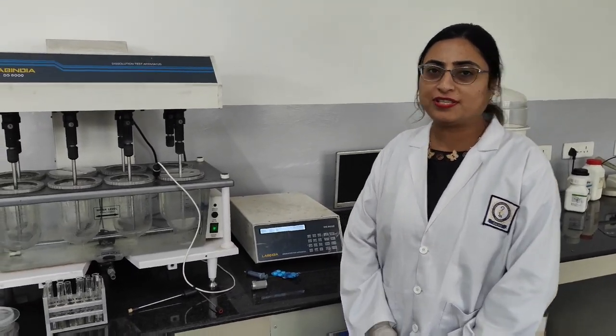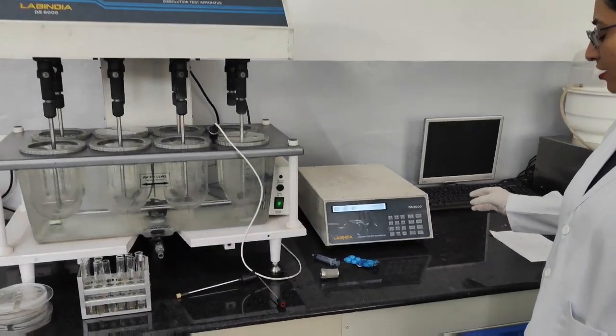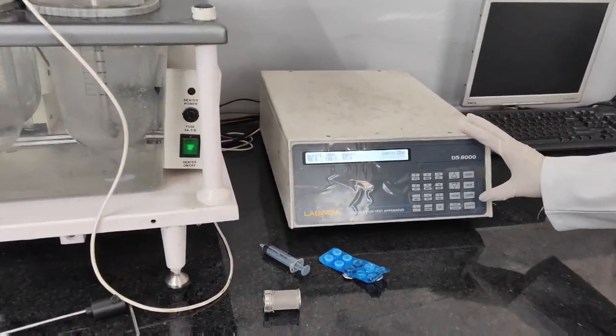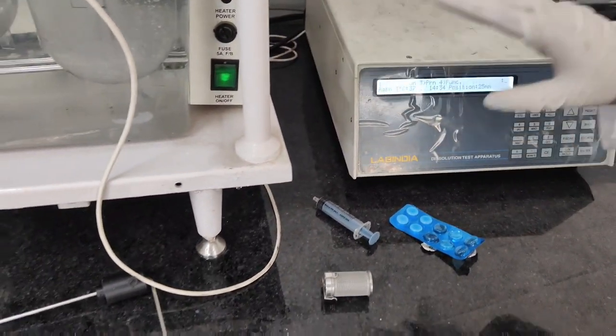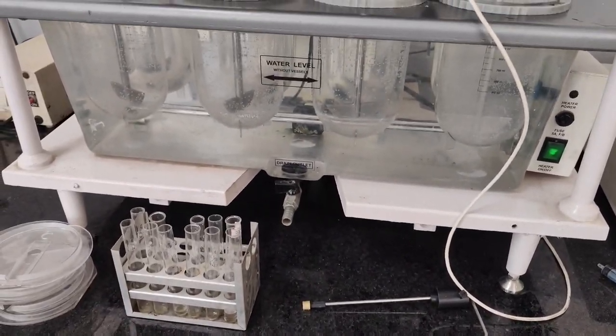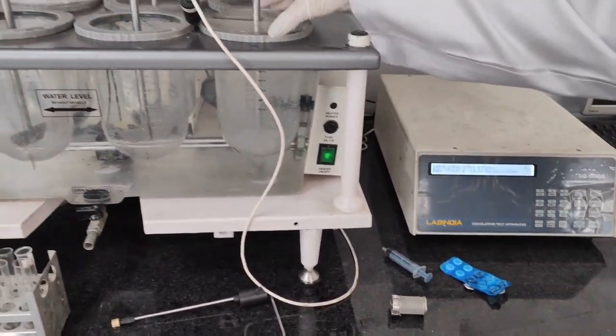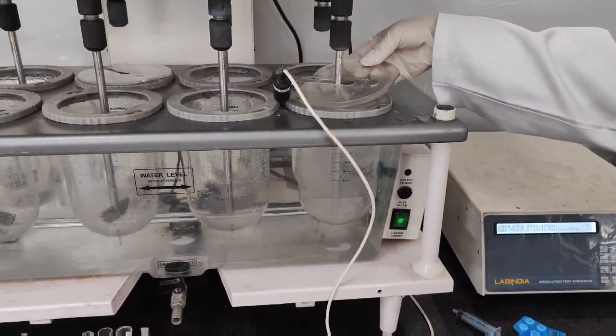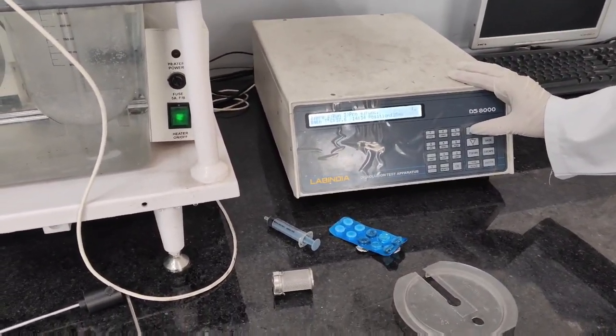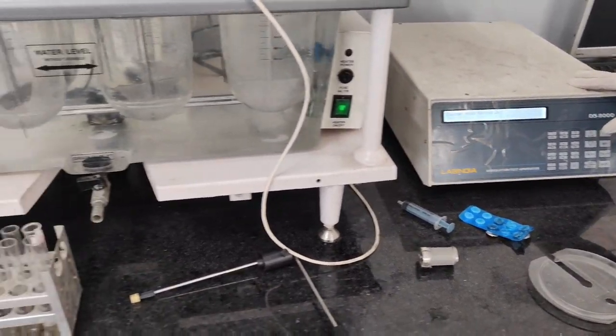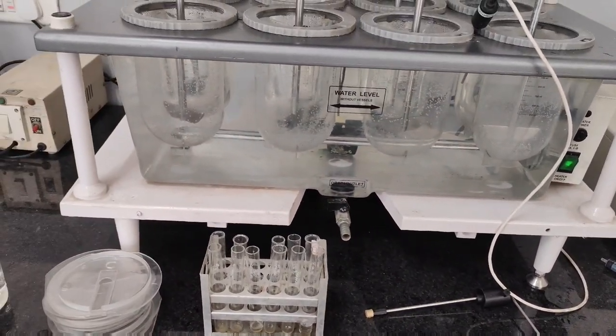Now after we have withdrawn all the 6 samples, we will stop this dissolution assembly. We will press the escape button. You see the paddles have stopped. Then we will remove this cap. And afterwards we will press this up arrow, so that the paddles may reach their positions.